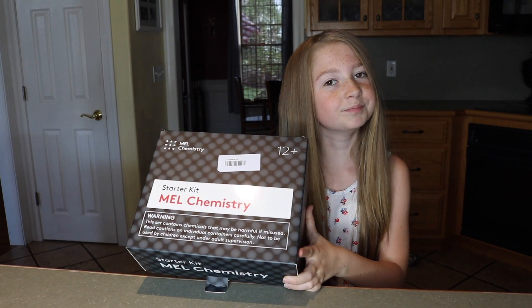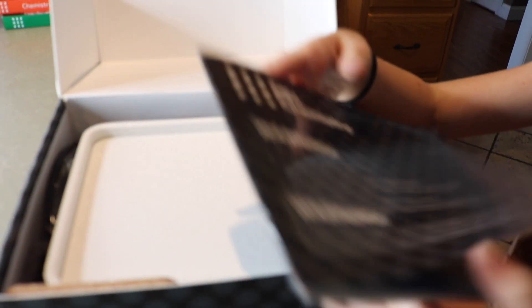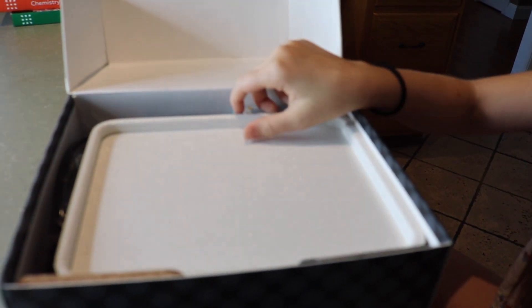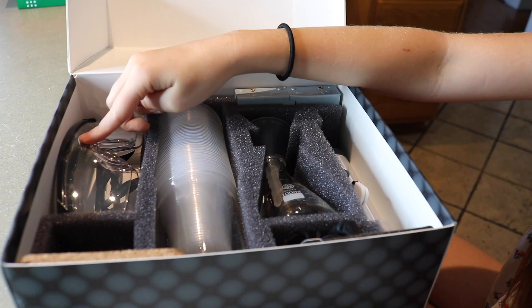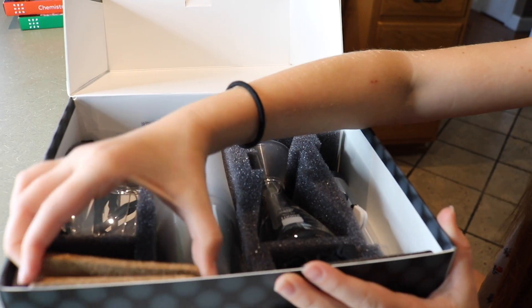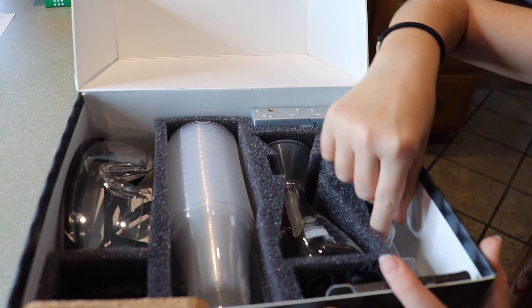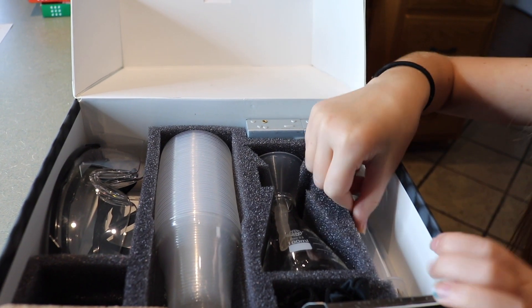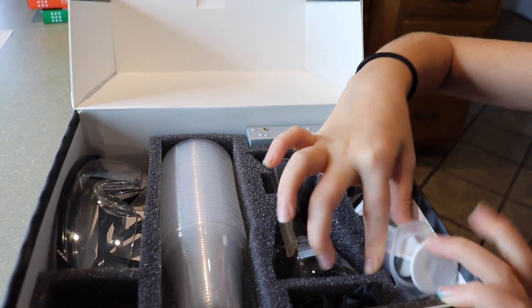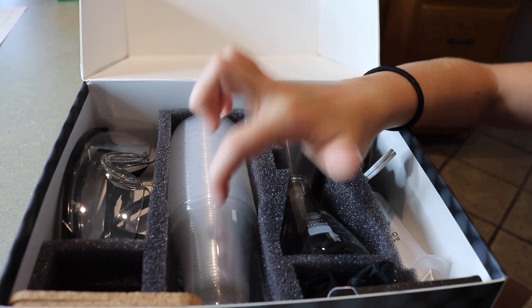This is the starter kit. When you open it up, the first thing you see is some much-needed instructions and a little tray, plastic cups, some goggles, these little stoppers, some corks. A phone holder, a syringe, a beaker, and a funnel, and a glass cup.